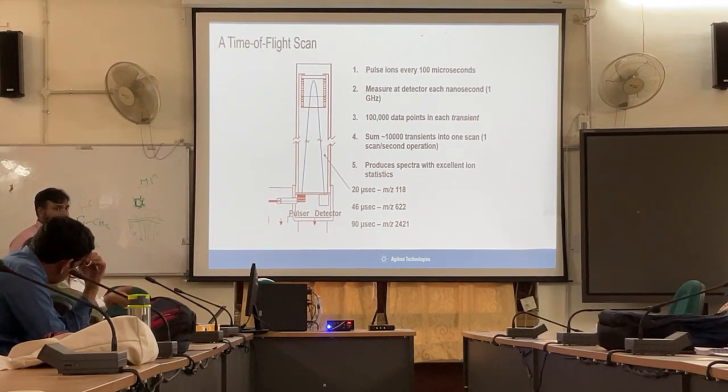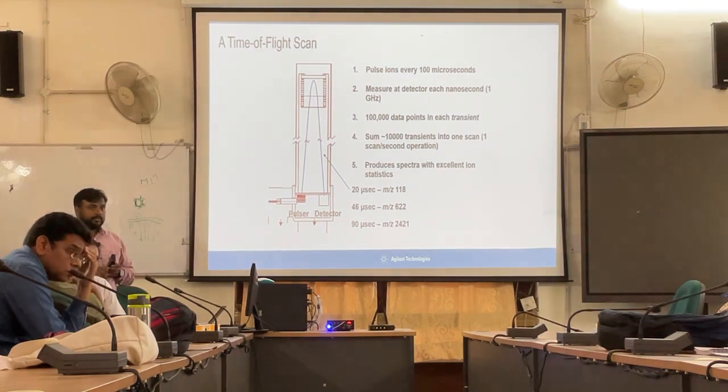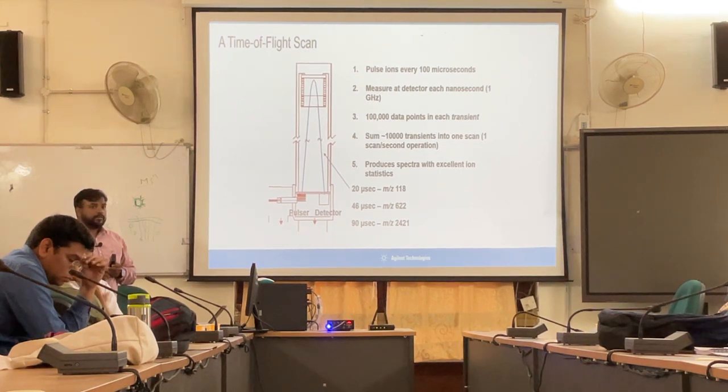If you cover 1700 m/z, you will be covering 5 masses. So it is a 5-point calibration or 7-point calibration. And one sample should be calibrated before we take up any experiment. Before starting any experiment in the day, you establish this relationship.